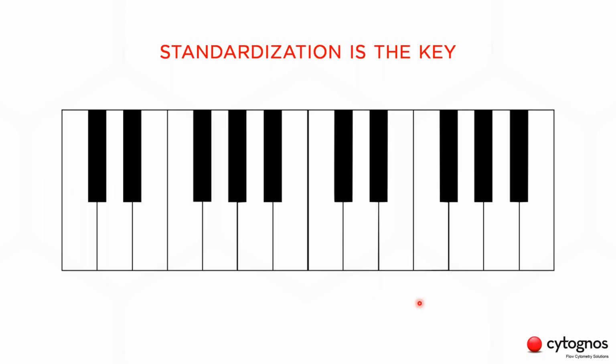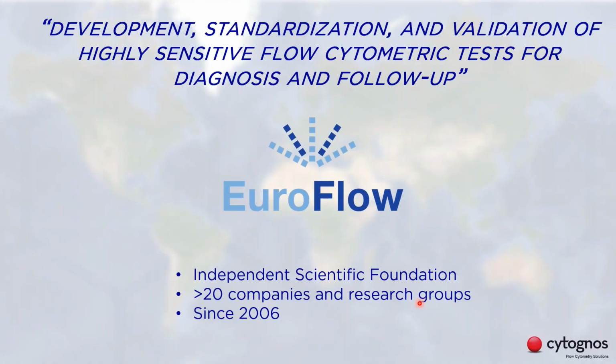So the question is, is there a way we can get consistent results over time across instruments and operators, save time and save money while we comply with regulatory bodies? The answer is yes, by standardizing all the steps in our clinical routine. And that's exactly what the EuroFlow method is about.